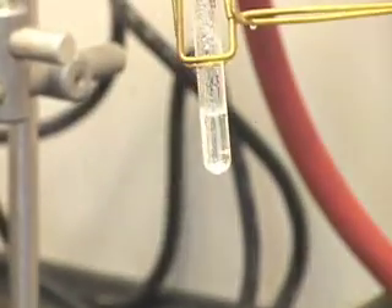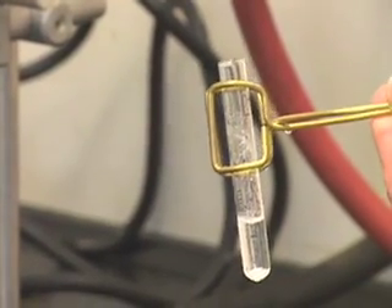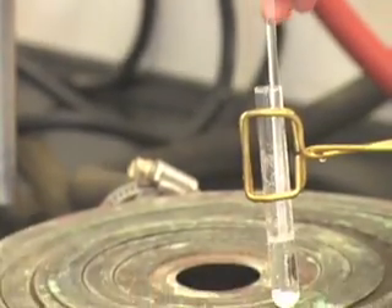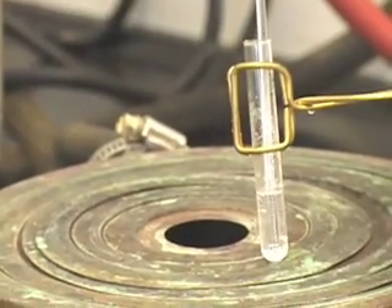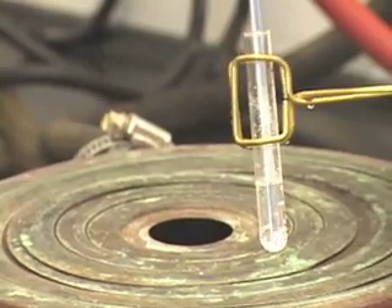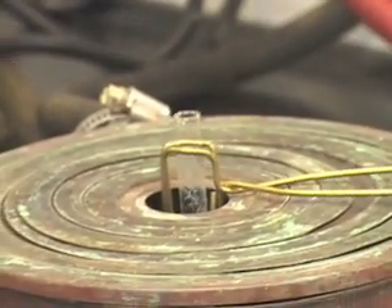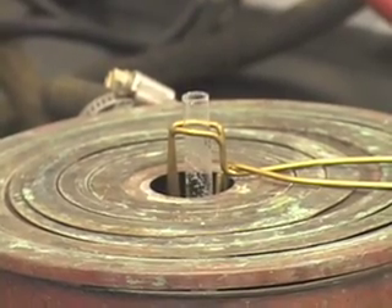If you notice there are big chunks, you may want to crush them — use a small glass rod to crush the solid. And because this is water, you can leave the test tube in the steam bath for a couple of minutes.